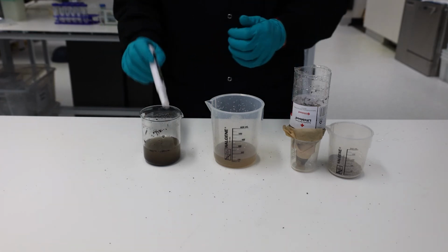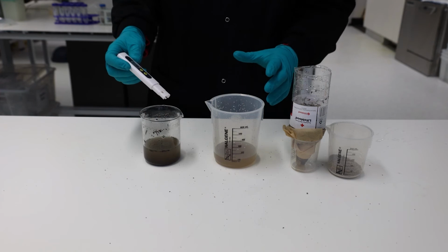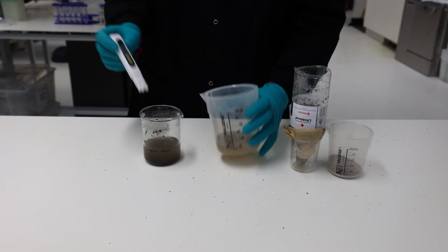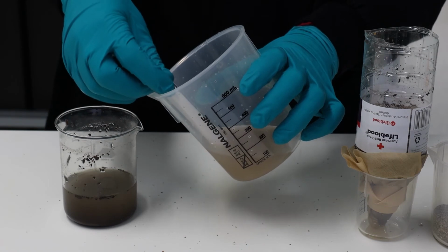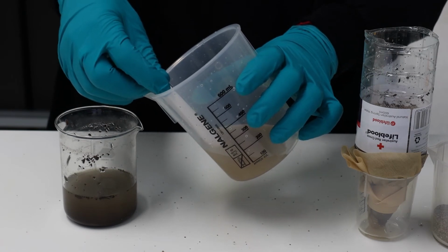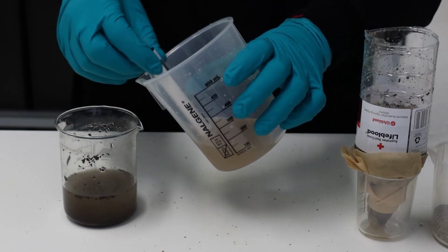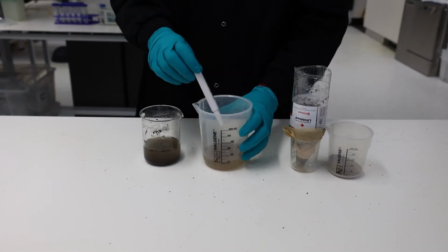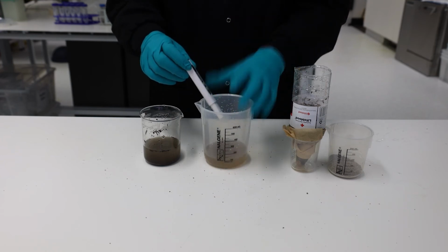Still technically safe for human consumption from a salinity point of view, but not very tasty. But let's try this post-filter. This is much better. We're getting down to about 240 parts per million of dissolved solids. So while it might taste a little off, it's definitely safe for drinking in terms of how much salt there is in there.